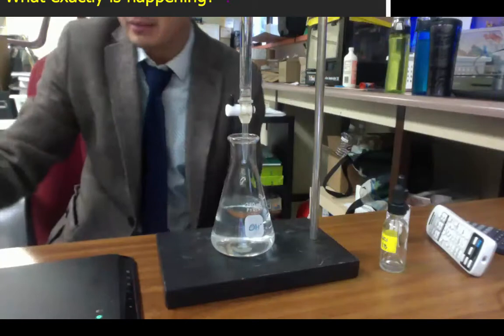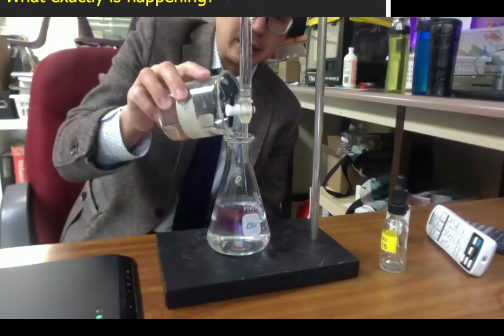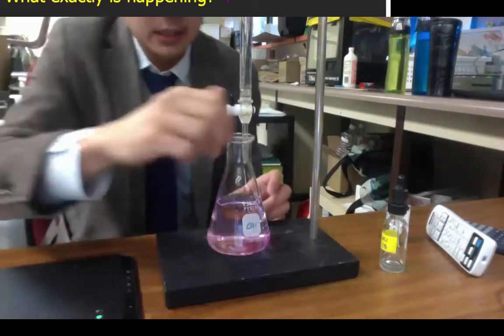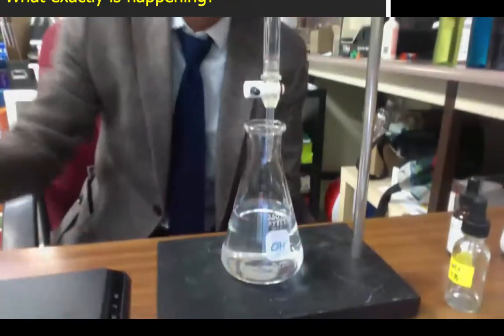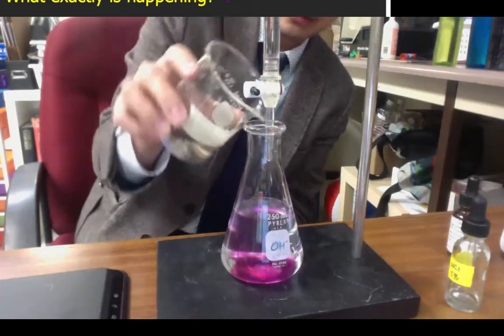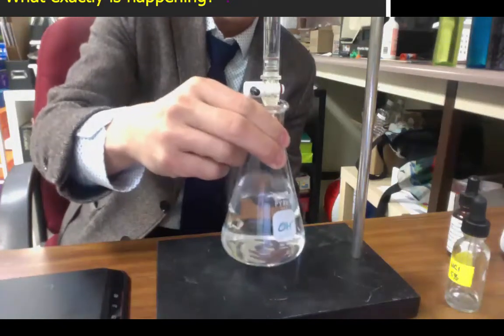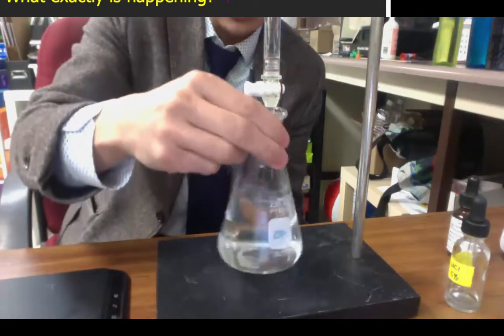And to save time, I'm going to show you the effects of this. I'm just going to pour a big chunk of my strong base here. So you can see that it is turning pink, and this is what you don't want to do: you don't want to overshoot. That means you don't want to pour too much base into here. That means that you don't want to have yours change to pink really fast. So right now it still turns back to colorless, so it's okay. So this is where I want to continue dispensing very slowly.